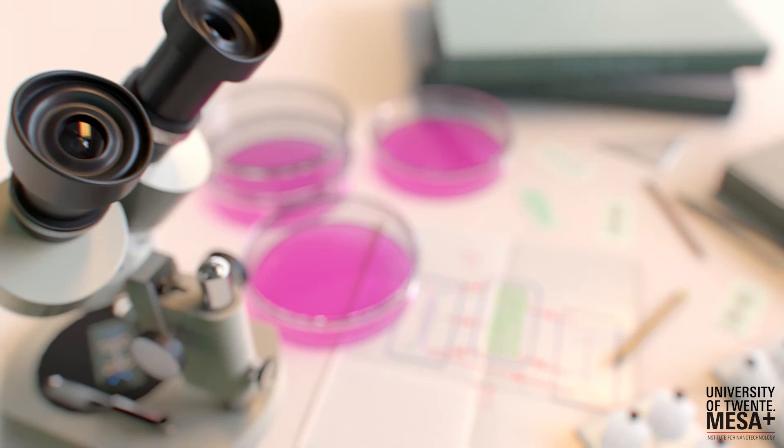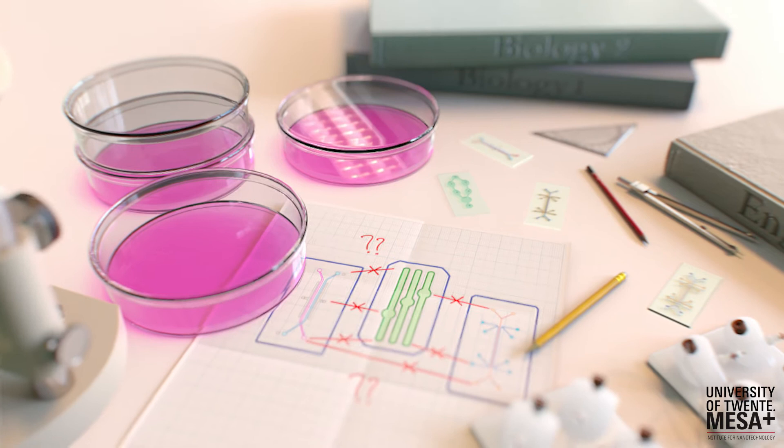Often, these systems are bulky and they are almost always incompatible with each other. To enable biologists and chip developers to focus on making new organs-on-chips instead of control and readout systems, we introduce the translational organ-on-chip platform.